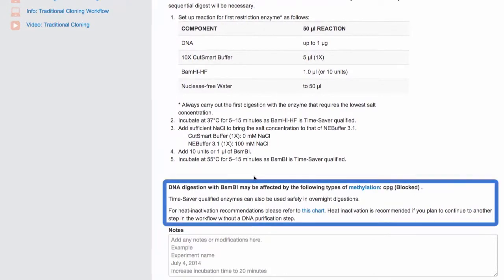Things to note, NEB Cloner tells you about the methylation sensitivities of each of the enzymes selected. In this case, BsmBI may be affected by CpG methylation.